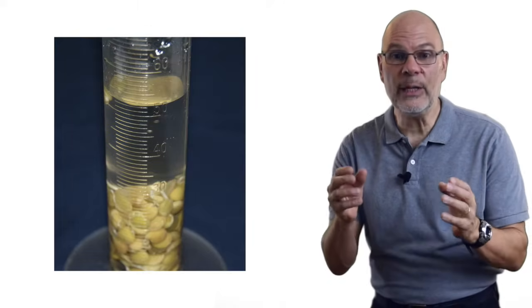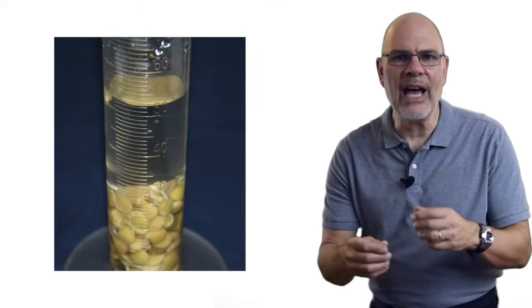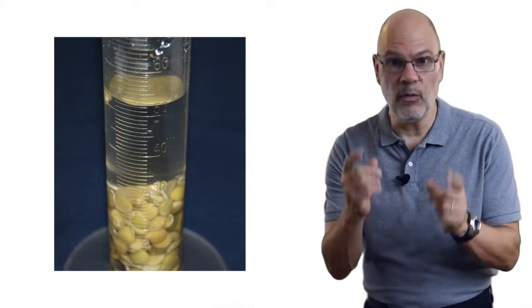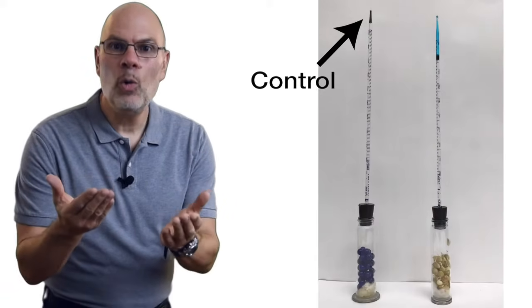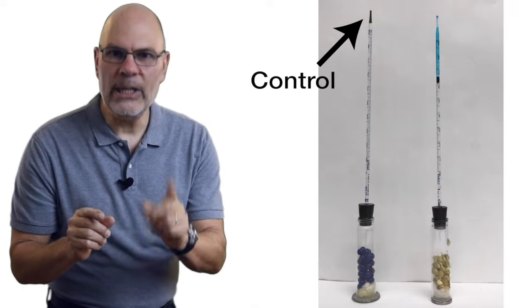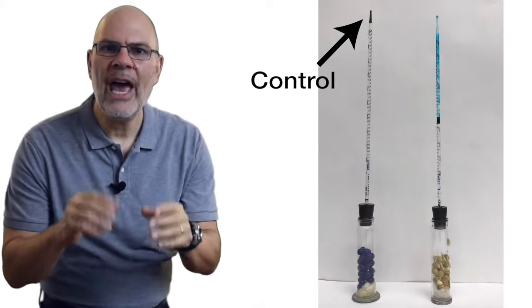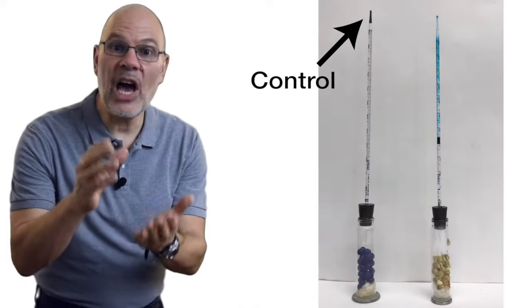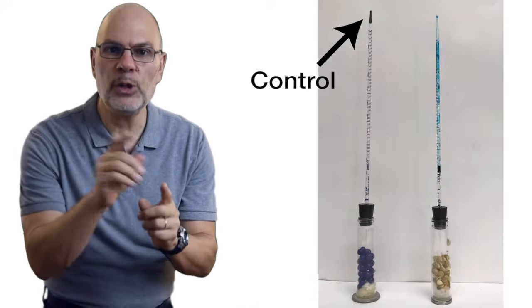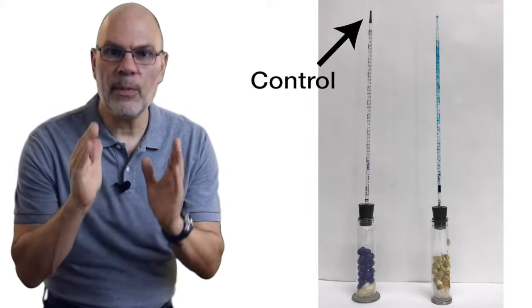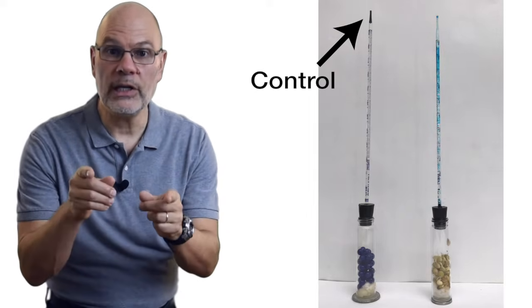To make sure that the volumes are equal, you can use a method like measuring volume by displacement of water. Now, let's observe this again with a control. Notice that in the control respirometer, the level of the food coloring isn't changing. And that means that the gas volume inside the respirometer isn't changing. The only difference between these two respirometers is the presence of our respiring organism.